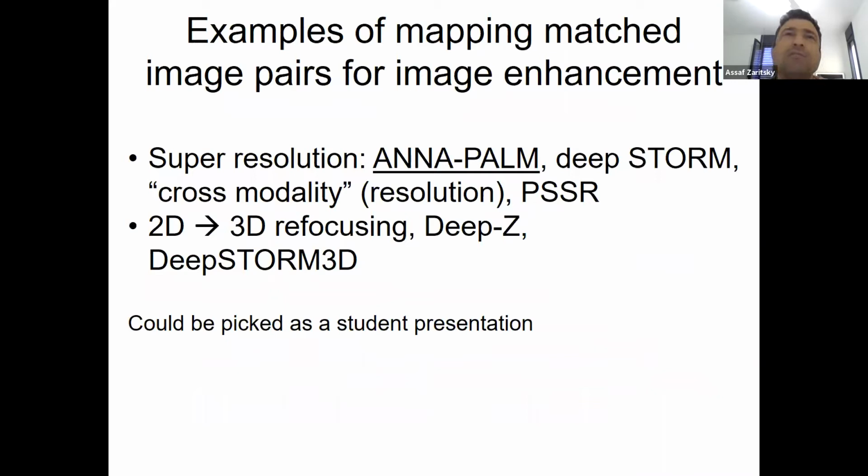And now after CARE came out, well, actually Anna Palm is another paper, nice papers that I'm going to show you next. But then other papers came out with basically the same idea of mapping one modality to another modality, and by that improving the quality of the image. So you could see here a bunch of papers that do it.